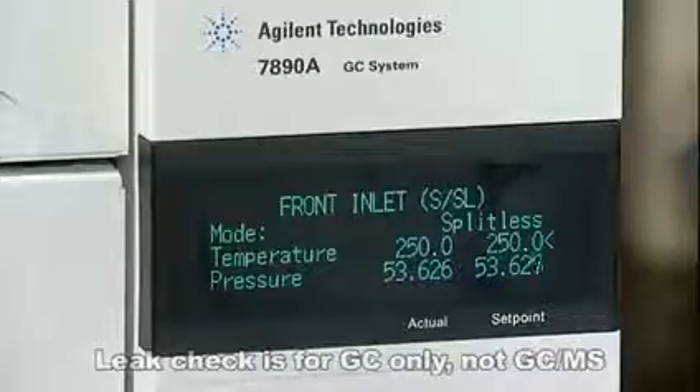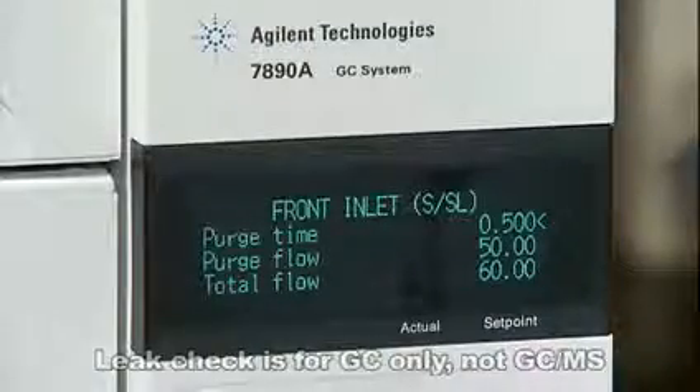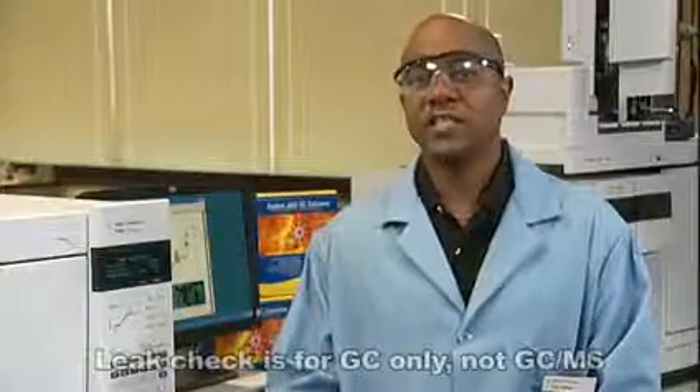You may have to adjust the inlet pressure to achieve your set points of the column flow. Press prep run to shut off the purge valve — this is the split vent flow — then change the inlet configuration. You may have to press it twice if your GC is not ready.